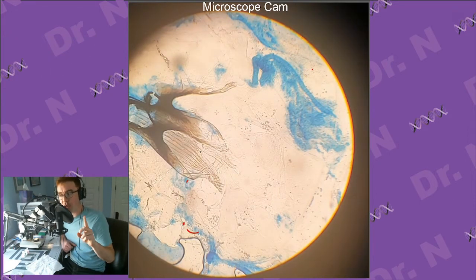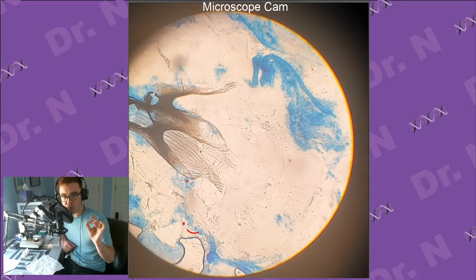Yes and no. So that's squishing with as much force as I could. You have to think about molecularly what we're doing. I'm trying to squish down DNA, which is really, really thin. There should be enough space and force between the two glass plates, the cover slip and the slide itself, where I actually can't break the DNA. Rather, I destroy the entire cell, which is exactly what I wanted to do. But the DNA is squished down nice and safe.